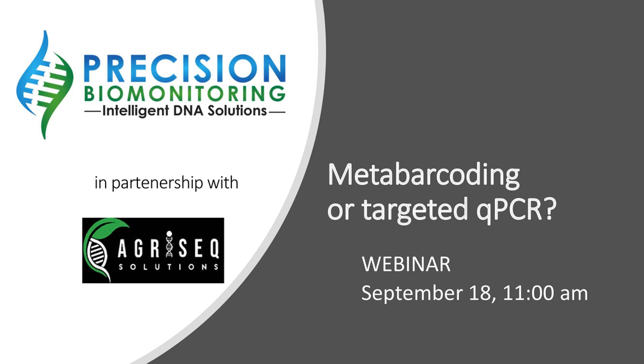In Canada, in 2019 so far, we have seen as much as 4 times greater use of eDNA methods compared to last year. Of course, we are seeing early adopters, more adept to accept the scientific evidence, and it's only a question of time for everyone, including regulatory agencies, to support switching to eDNA for more reliable survey results.